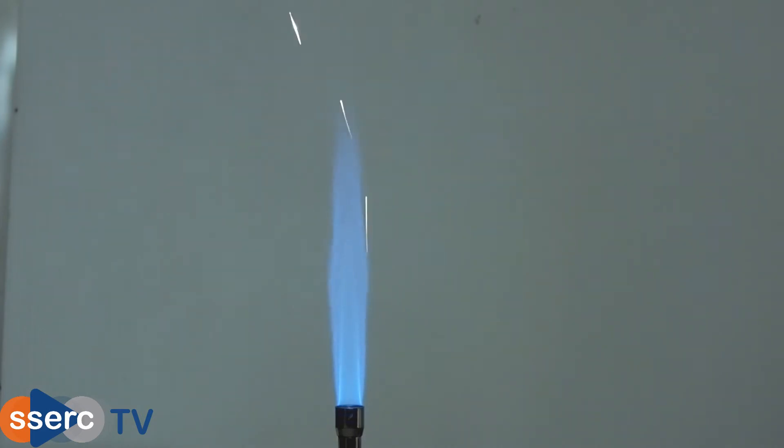If you sprinkle powdered iron into a bunsen burner flame you'll see a series of bright sparks as the small particles of iron burn. This is used in quite a lot of fireworks.